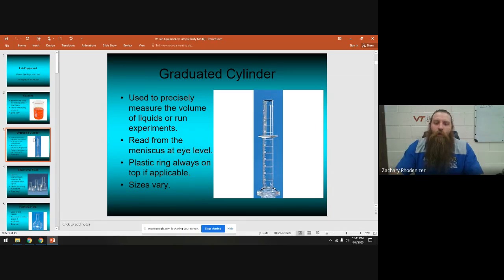A graduated cylinder is what we use to measure volume. Many of our graduated cylinders have plastic tops — those are very important. The collar should be above the tick marks and lined up with the beaker lip. This collar has two purposes: number one, if you're pouring and spill a little it will catch it; and number two, if it falls it lands on the plastic collar instead of breaking the glass.